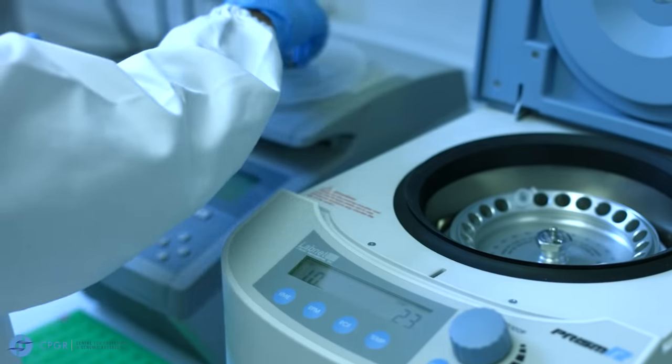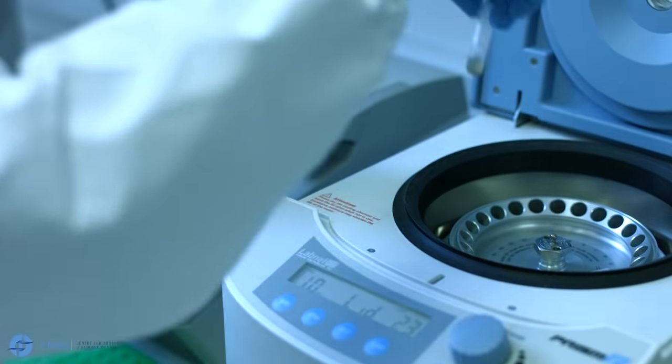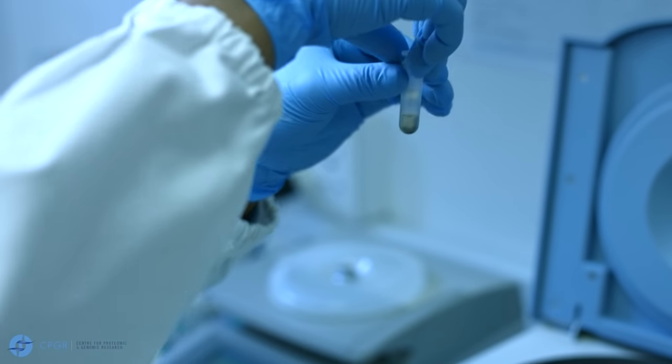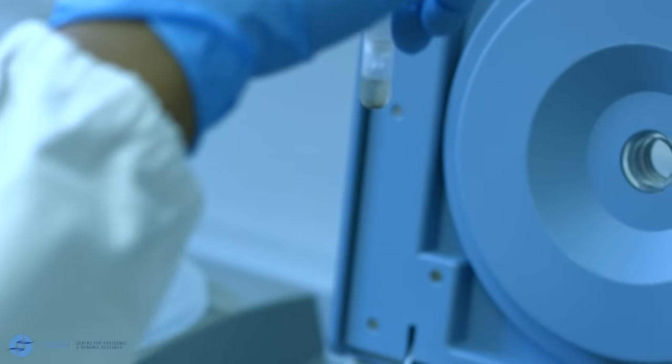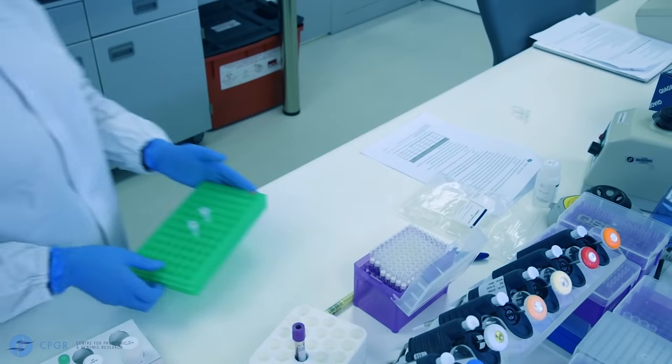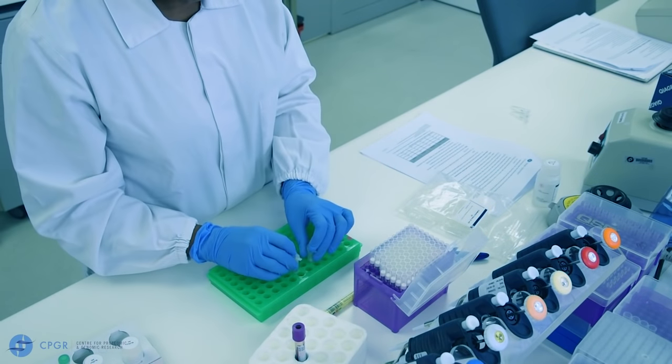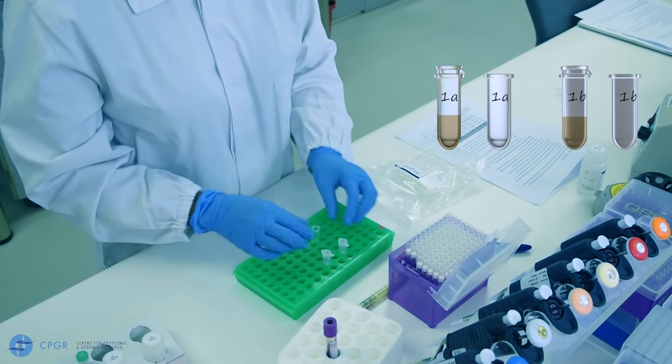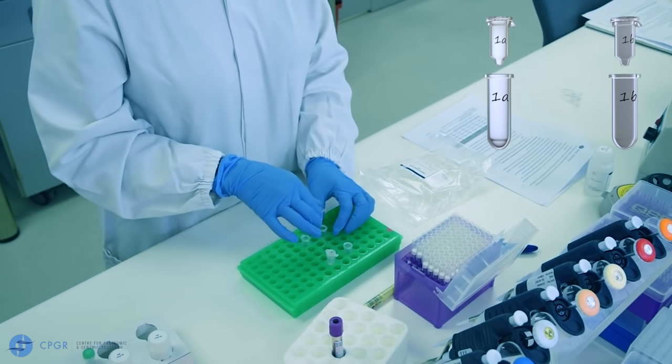At the end of the centrifugation period, check that all the filtrate is in the collection tube. If there is still some in the spin column, just repeat that centrifugation step. Discard the collection tube and transfer the spin columns to clean collection tubes.